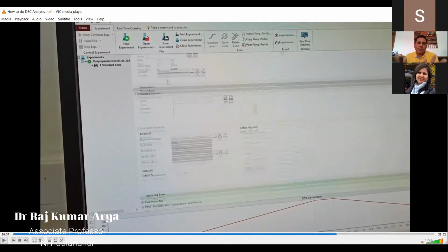To optimize equipment performance, or make better use of the facility and power consumption, you can optimize the sample heating rate. Maybe 10 is generally preferred, but sometimes if you miss some transitions or peaks in the sample at 10, you have to practically lower it. It's the safer side. If your sample is completely unknown and you don't know any history about how it was prepared, it's better to go with slow heating as much as possible.